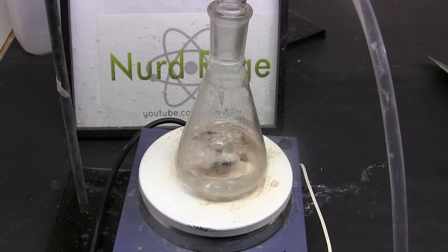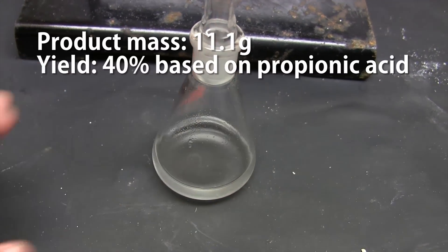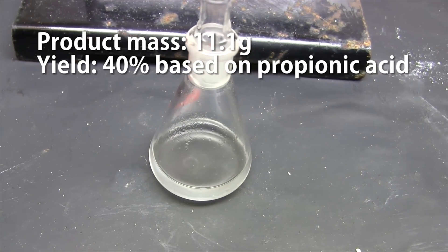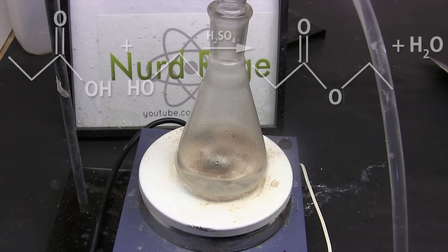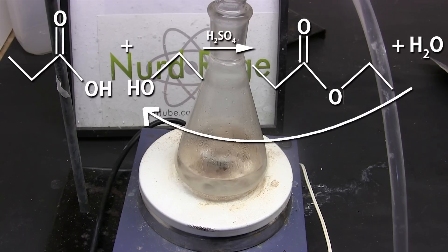If you want to review that video you can check the video description. The drawback of that method was that our raw yield was about 40%, and that was likely inflated since we hadn't purified by distillation yet. The reason the yield was so low is that the reaction is reversible — water can react with the ethyl propionate and produce propionic acid and ethanol again.